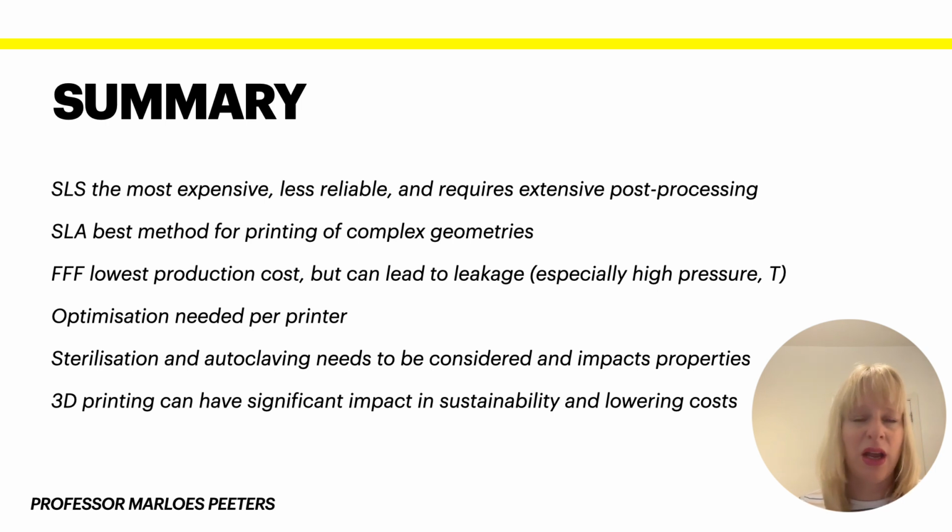So particularly in certain areas in the pharmaceutical industry where you're not producing something like bioethanol or things which are produced on really large scale, that might give you that versatility and flexibility. But until now, you will see that most of the time this 3D printing is used to consider different prototypes. And even then, it's not really used in industry that much. It's mainly limited to use in the lab.